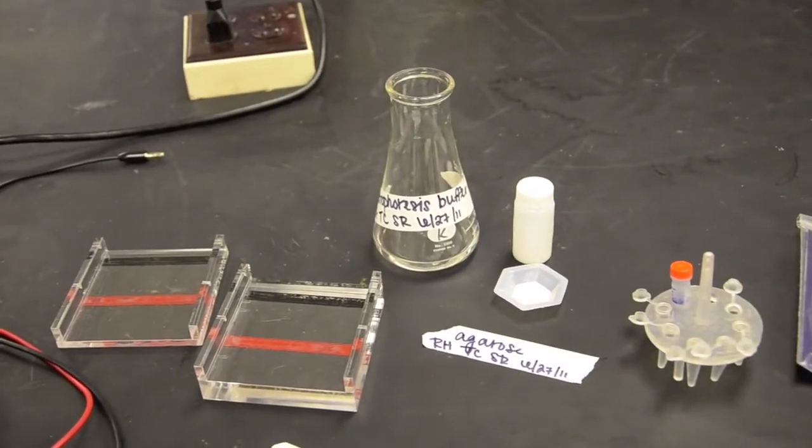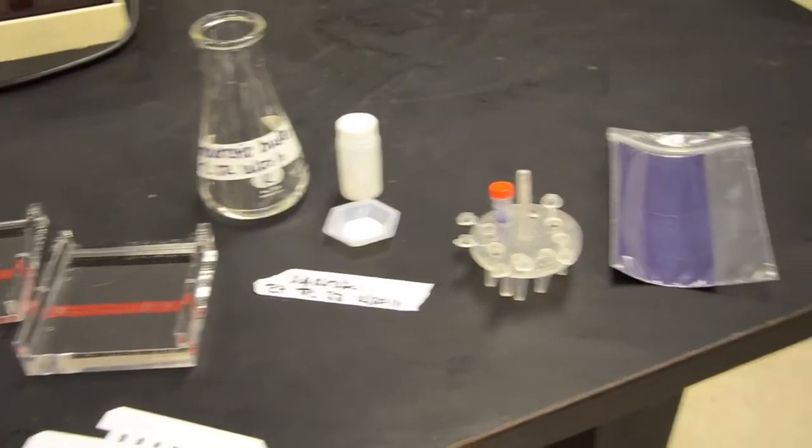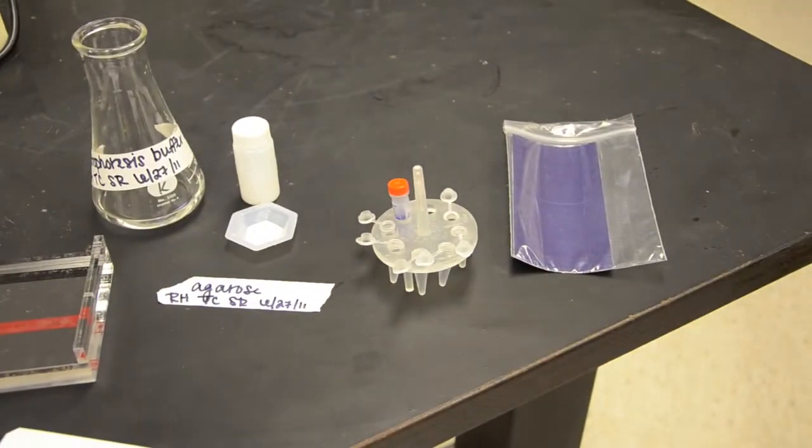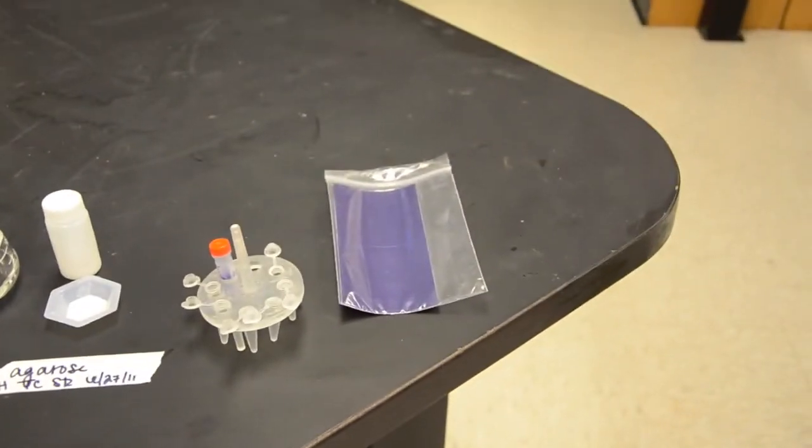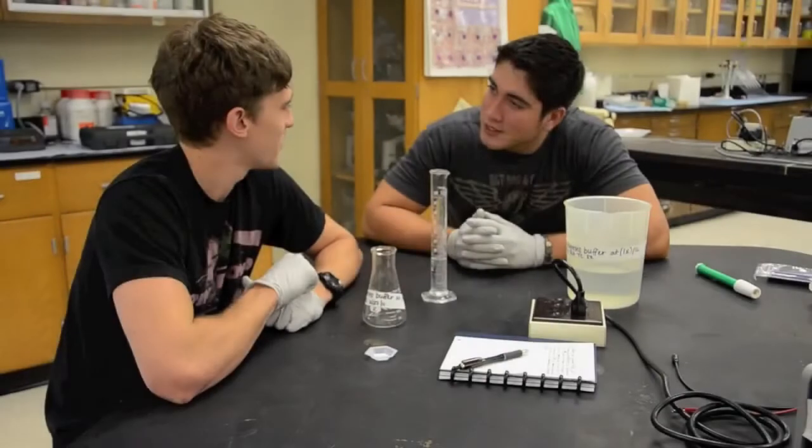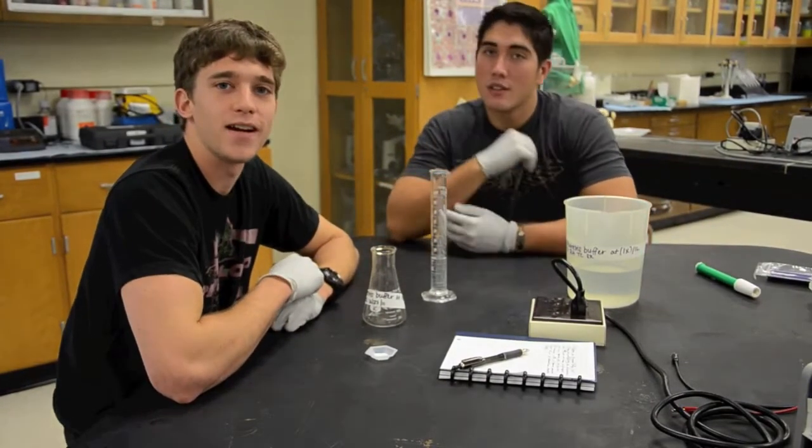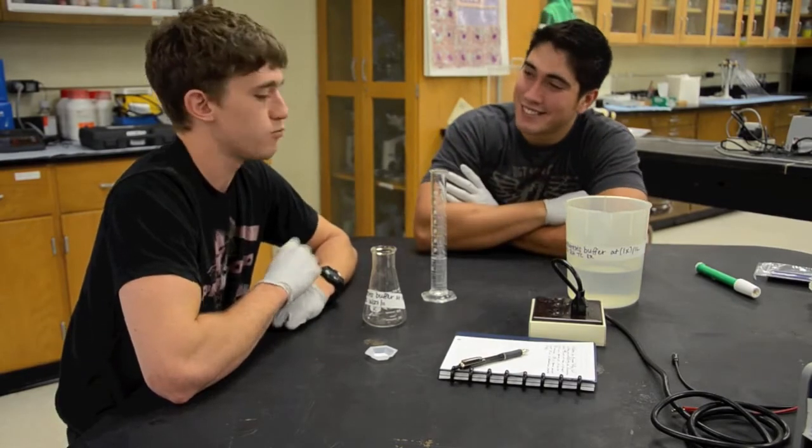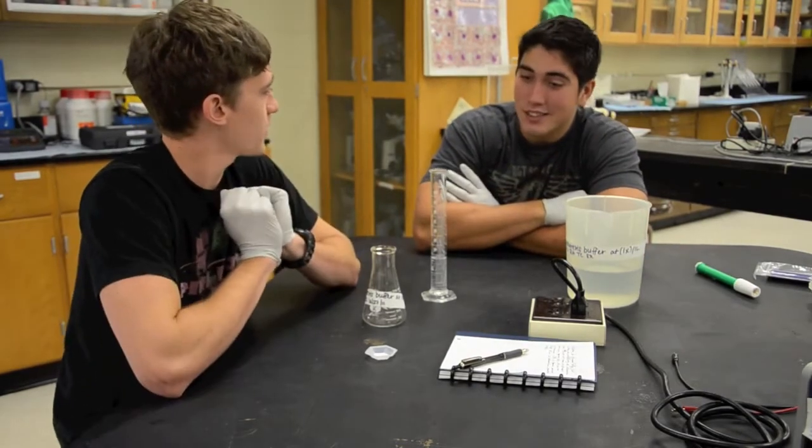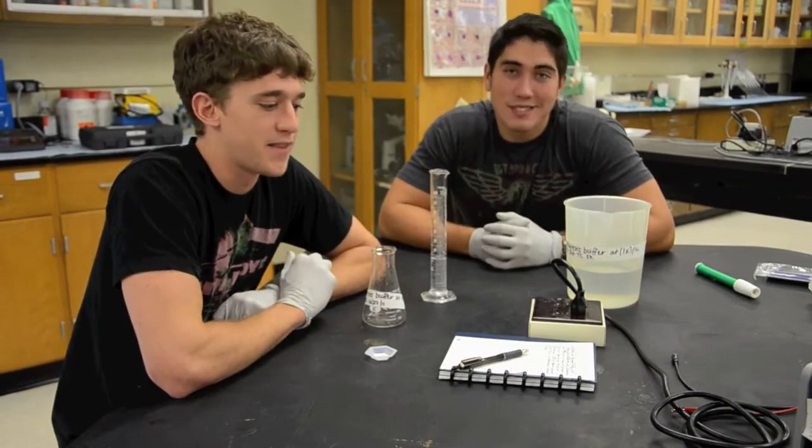Followed by the electrophoresis buffer, the agarose powder, microcentrifuge tubes, and flash blue which is carcinogenic so be sure to wear gloves. Oh we didn't see you there. Well, we might as well talk about the electrophoresis lab.